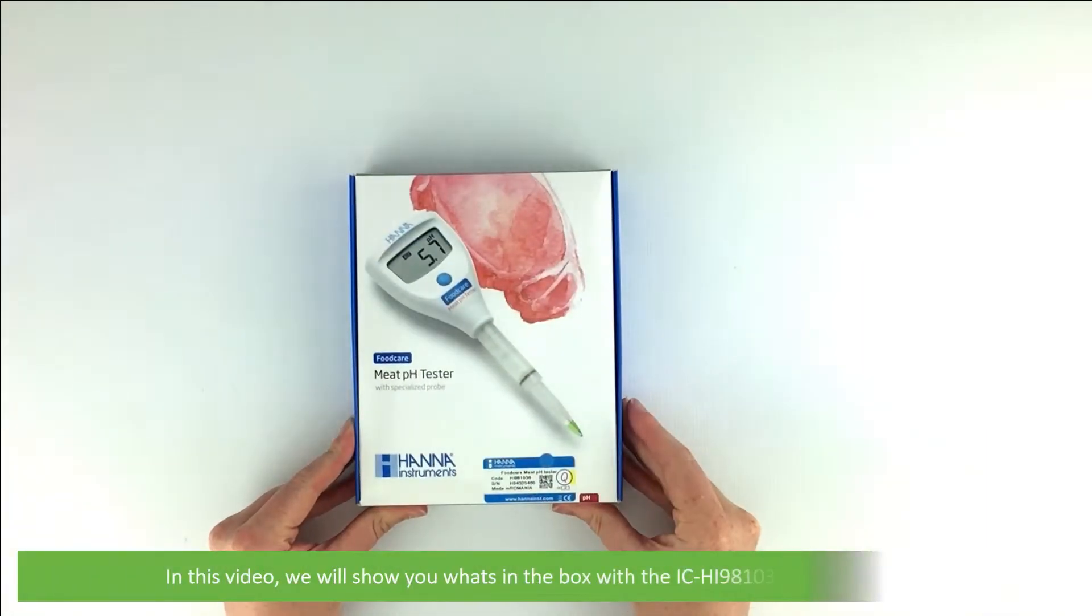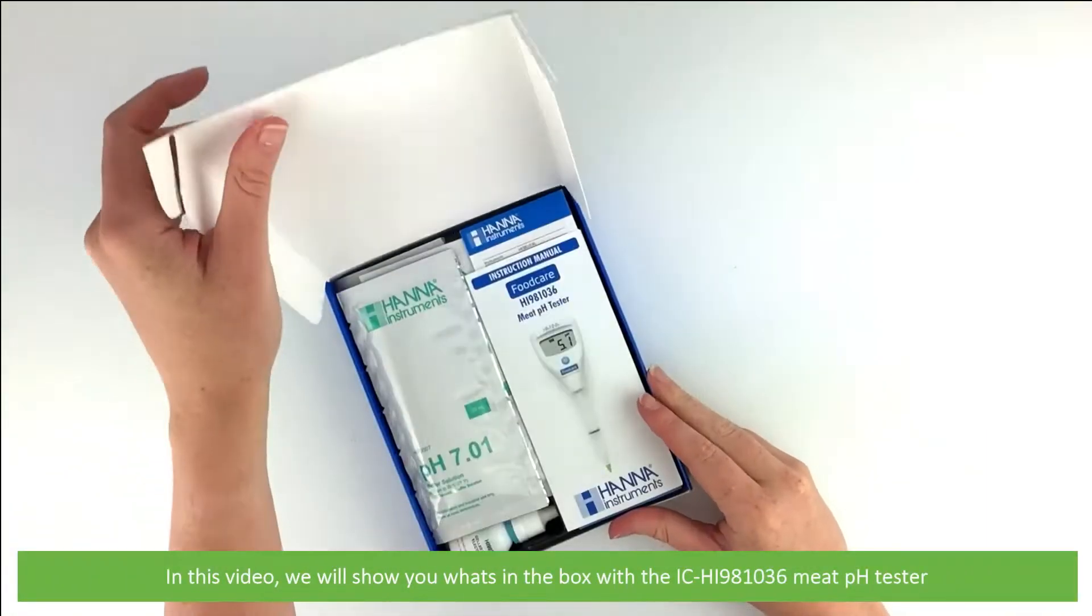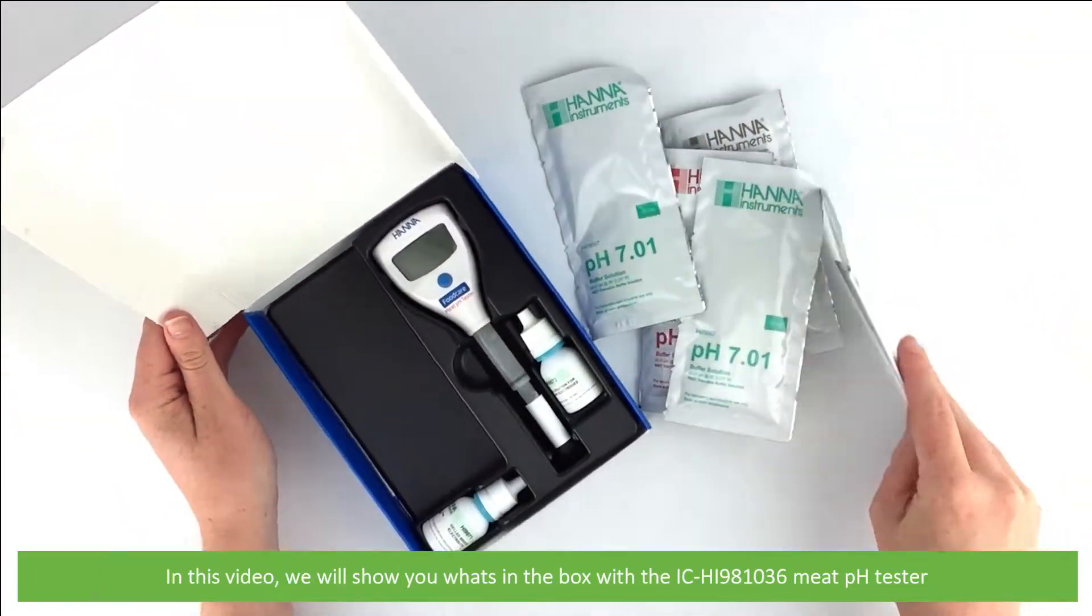Hi and welcome to another Instrument Choice support video. In this video we'll show you what's in the box with the IC HI981036 meat pH tester.